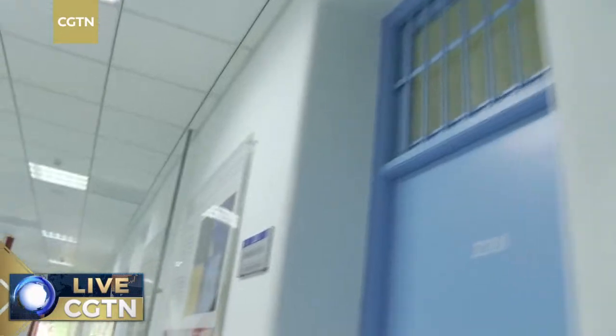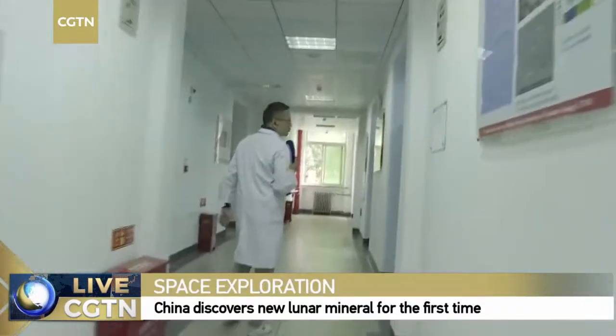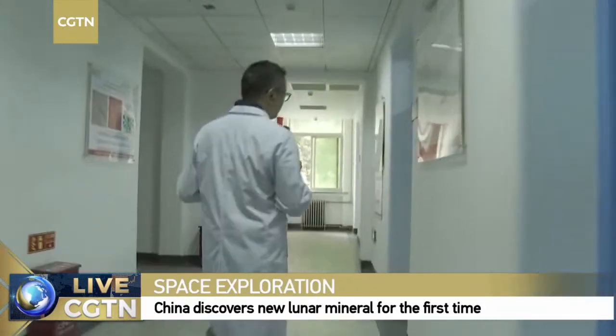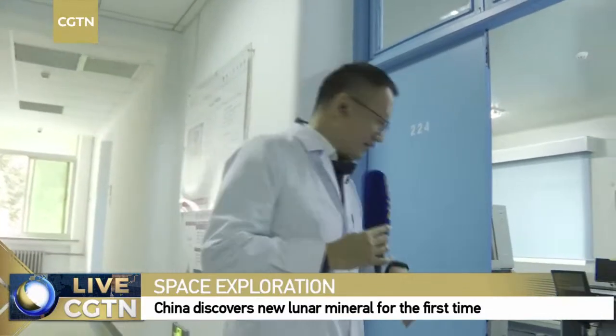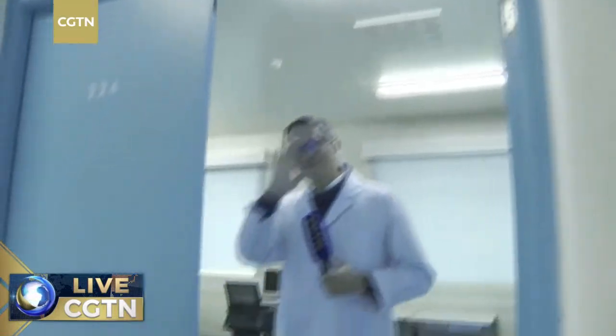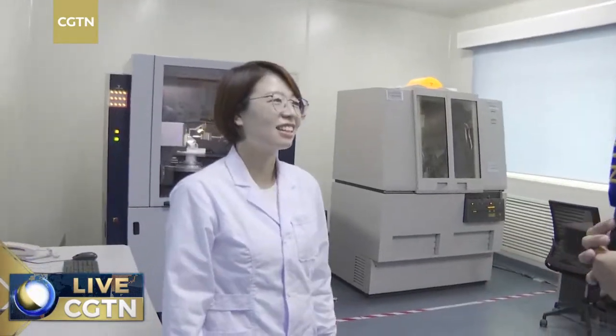There are different laboratories, different sites, with scanning electron microscopes, line scanning, point analysis, and map analysis, in different rooms for different purposes. According to the press release this morning, the biggest discovery is about the new minerals. Inside this laboratory, we're going to meet Mrs. Li Ping, who is a researcher in this field. Hi, Mrs. Li Ping, good to see you. This morning I saw you in the press release because you are one of the backbones of this project. Can you describe to our audience what you usually do in this laboratory and what the connection is between this laboratory and the new minerals?